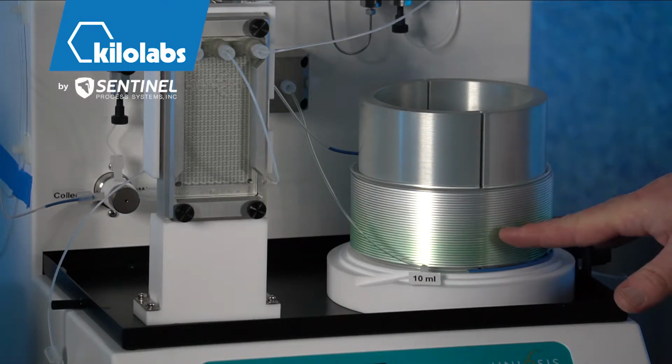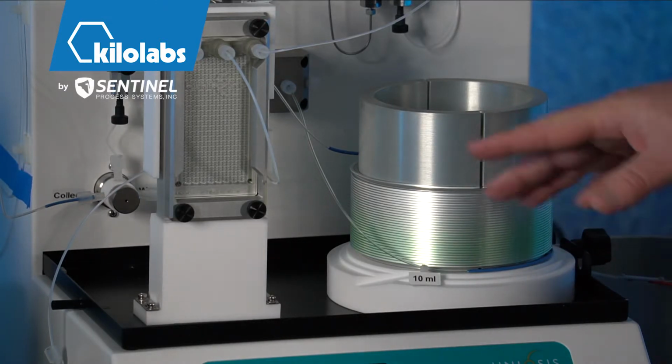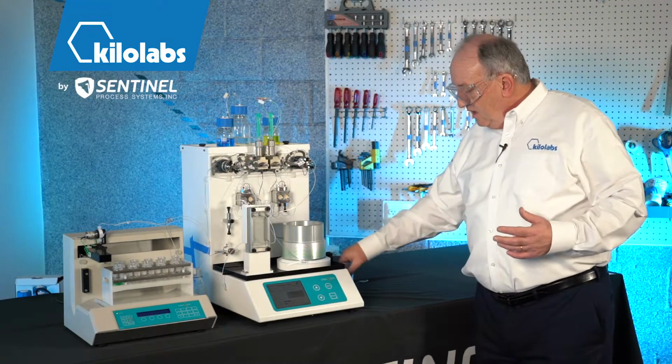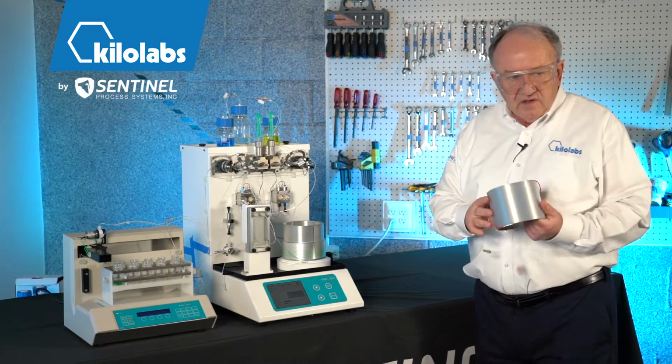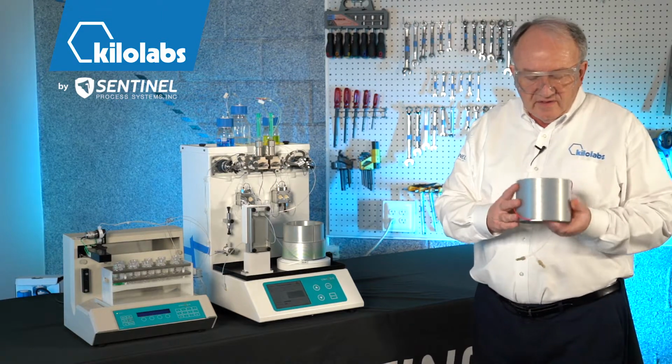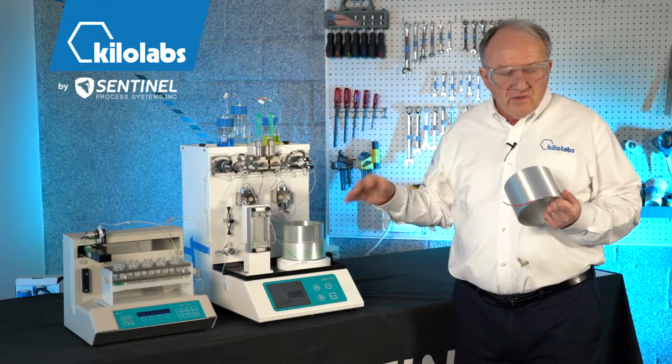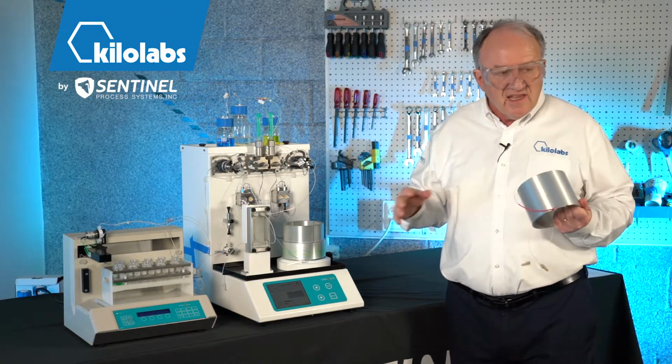And as this advances all the way through the coil, as you can see it, it'll go over to the fraction collector. Obviously, we have these PFA coils that are transparent. This is for the purpose of the demonstration. If you had a stainless steel coil, you obviously would not be able to see what's happening.